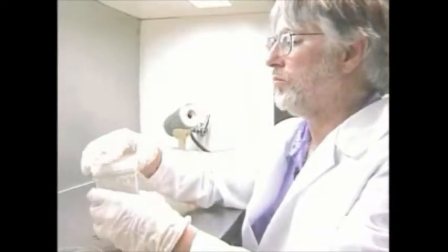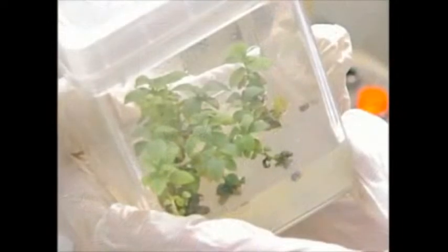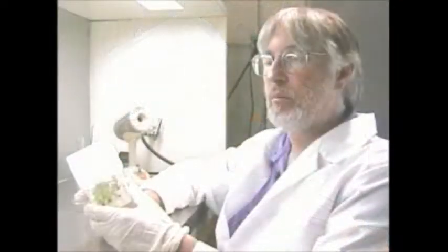And we get the requisite number of shoots in there. Close it up. Seal it off so it maintains aseptic conditions, and place it on a lighted growth shelf to grow on for another 4 to 6 weeks before we subculture it again. And so, once these microshoots have multiplied through several successive generations of subcultures, we have many, many shoots, as many as we need, perhaps 1.9 million if we need that many.